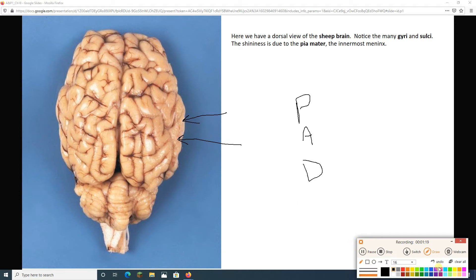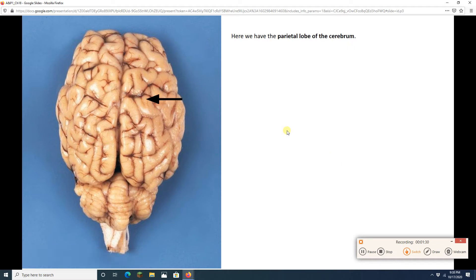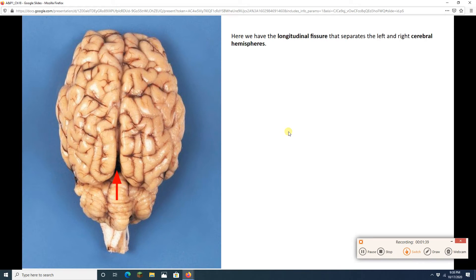We've got a nice dorsal view of the brain here. Let's start naming some stuff, then we'll cut this brain. We've got the frontal lobe up there in the front. If we go back a bit, we're in the parietal lobe. Go back a bit more, we're in the occipital lobe. Pretty straightforward. We've got the longitudinal fissure — remember, a fissure is a deep groove, and a sulcus is a shallow groove.